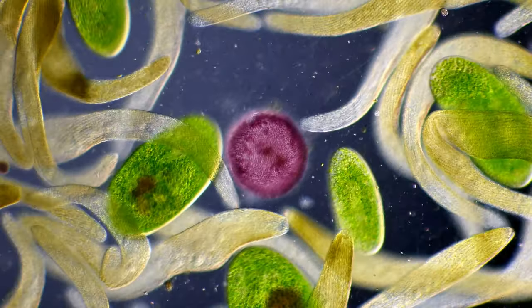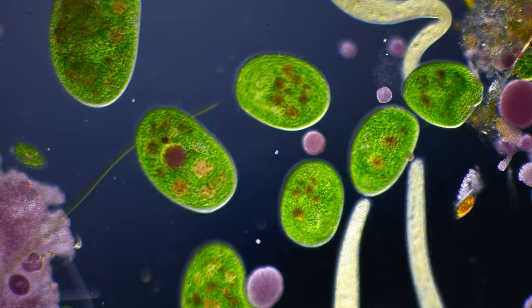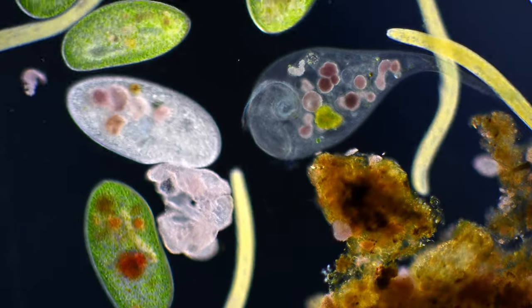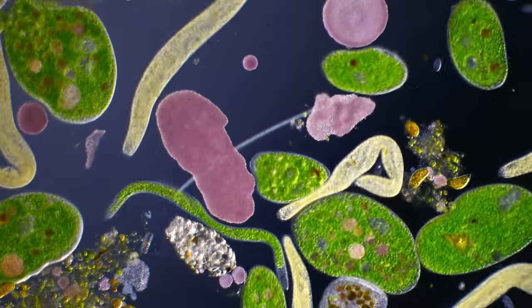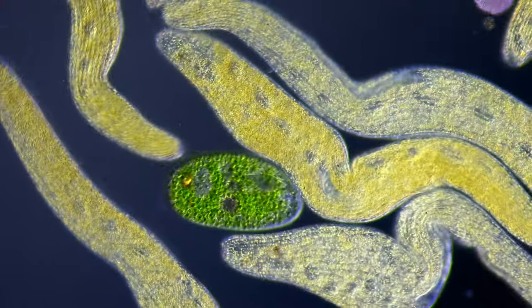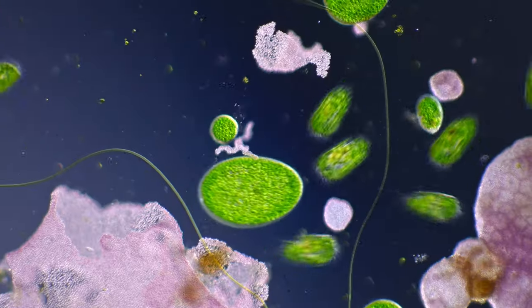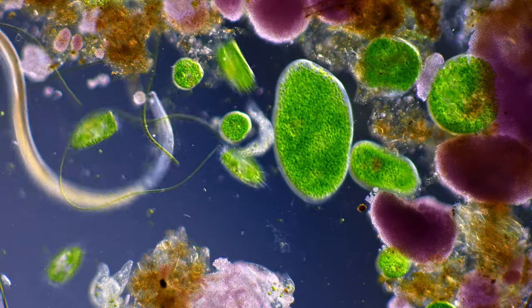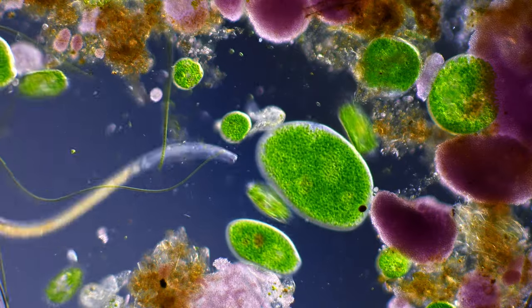When we think about single-celled life, we often picture tiny, amoeba-like, transparent, circular organisms. But life in the microworld isn't as simple as that. Single-celled organisms vary greatly in shape, size, color, and function. So in this video, we are taking a closer look at the incredible microscopic diversity in a few drops of water from a single forest pond sample.